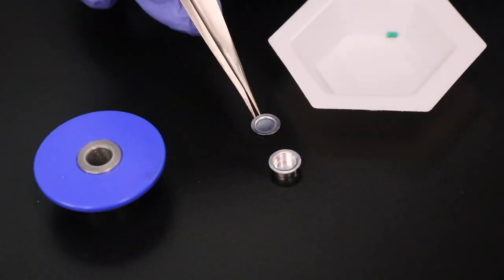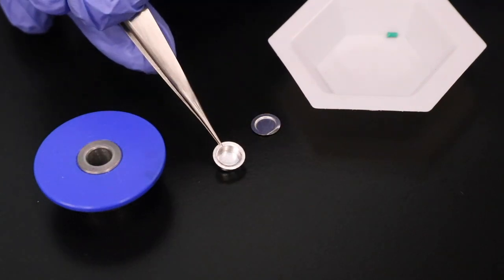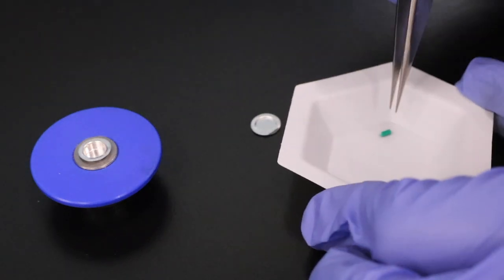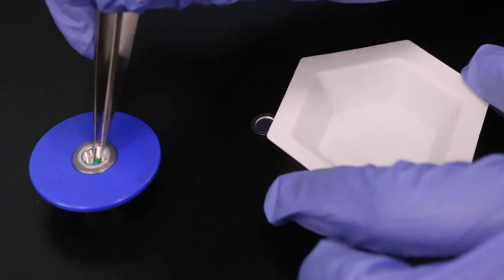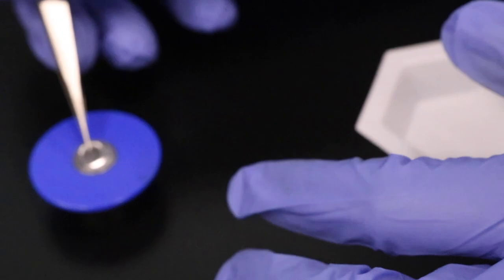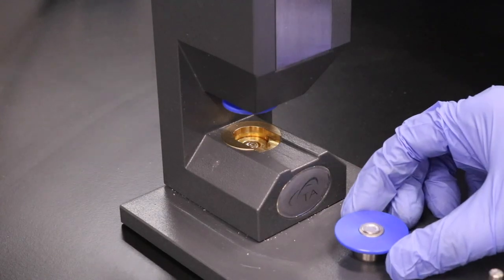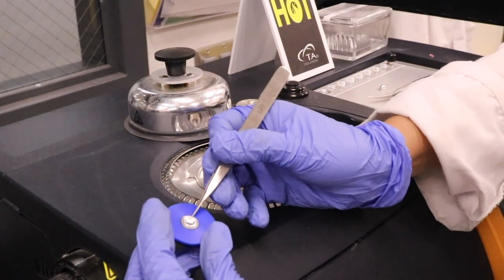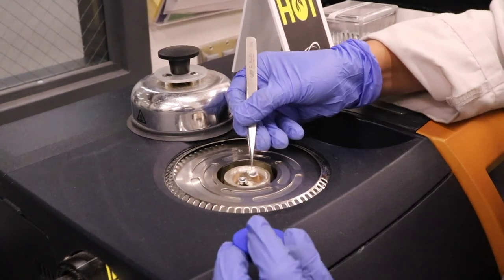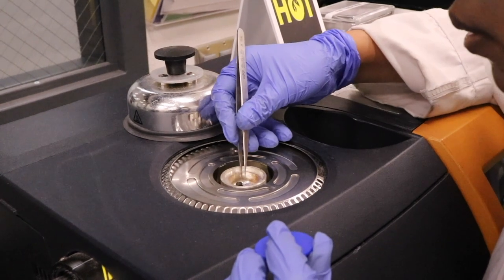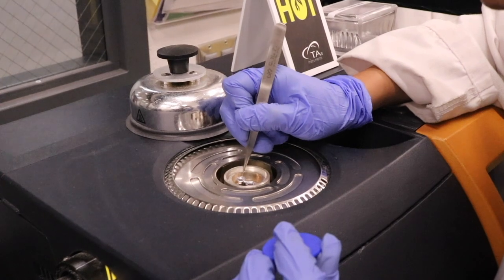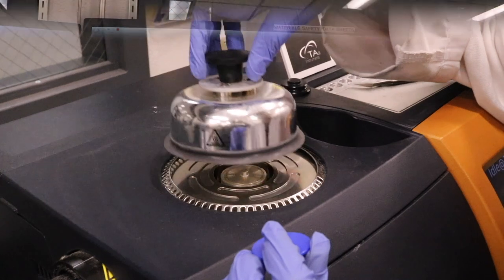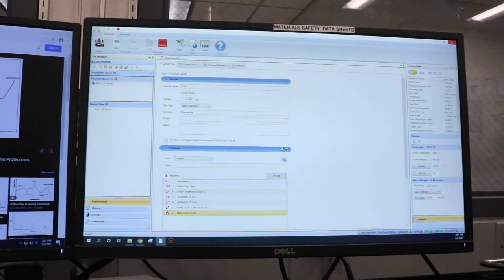Sample preparation is a very critical step to obtain an accurate DSC measurement. In this case, using a tweezer, we place the pan in the blue T-zero hermetic lower die. And then we place the sample having approximately less than 10 milligram weight into the pan. Press down the handle of the T-zero press to seal the pan and lid together. Then place the sealed DSC pan in the desired pan location inside the heating chamber. There are two thermocouples, one is for sample pan and one is for reference pan. Then we close the chamber with the lid and we start the procedure. After loading the sample in the chamber, we feed in the information about the sample like material, weight and the heating cycle like the heating rate up to the heating temperature in the software. And then we run the program.